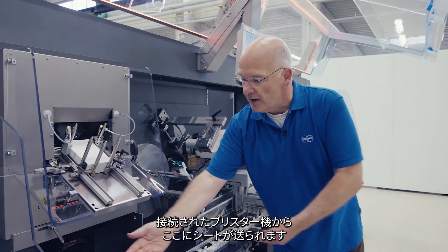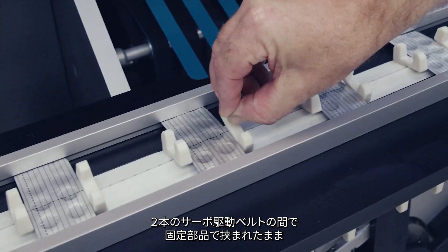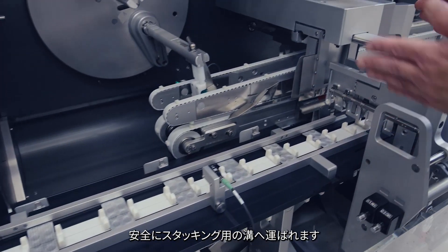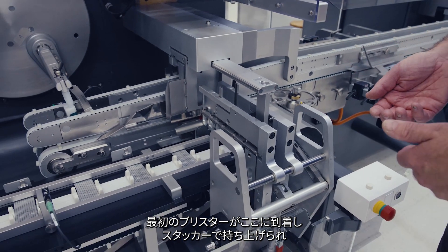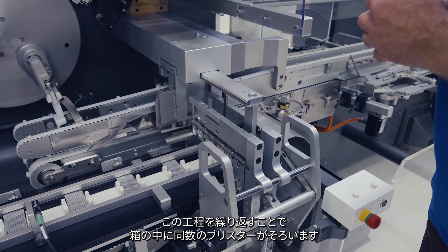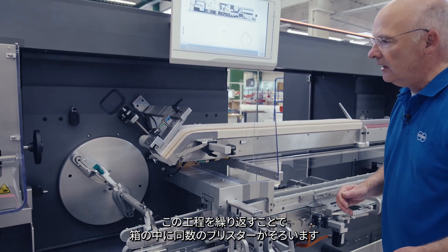Back to the process. Blisters are arriving from the pre-connected blister machine. Between two servo-driven belts, we transport the blisters safely between fingers to the stacking group. The first blister arriving is lifted up by the blister stacker. The next follows — we place the first one on top and repeat this process so that we have the right count of blisters for the carton.